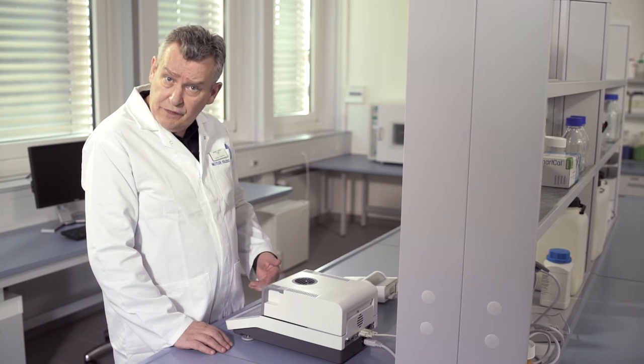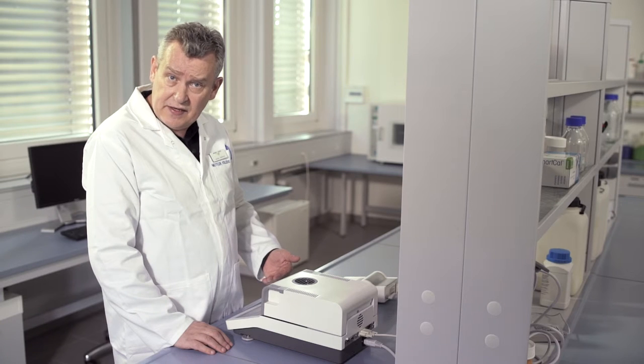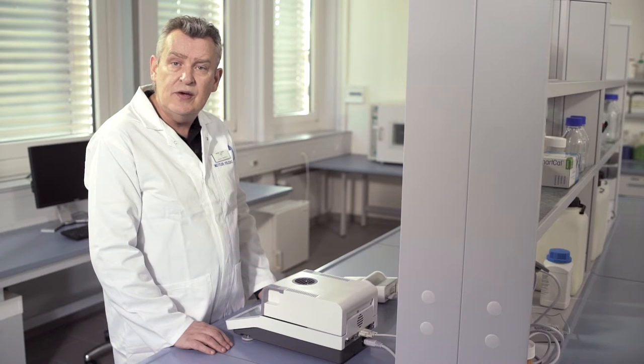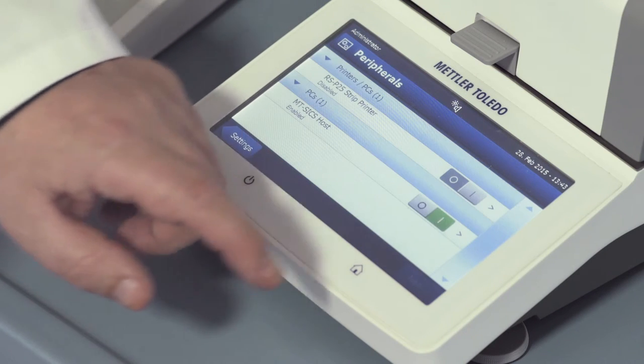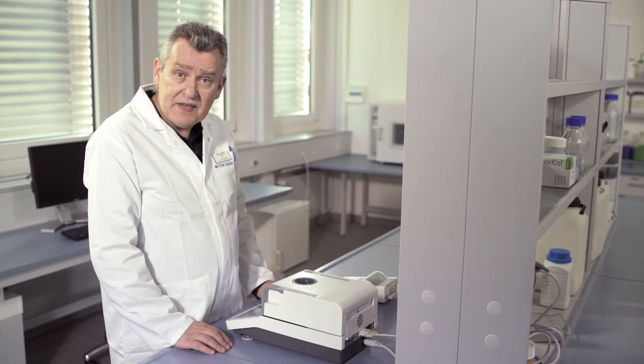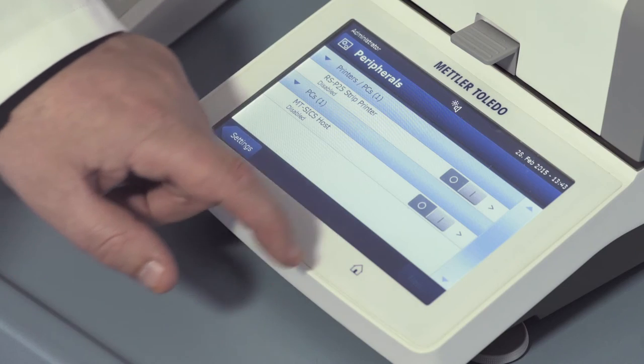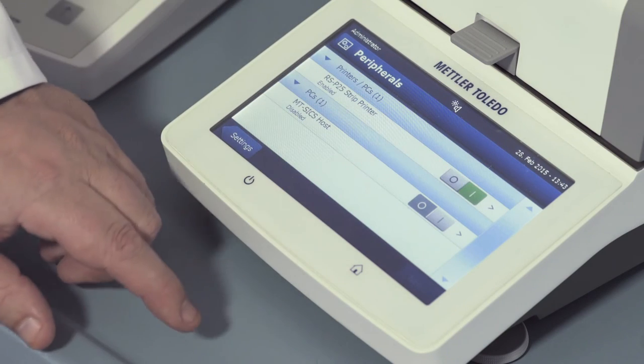However, you can also define customized interface settings in the menu of the HC103. Confirm the default settings simply by pressing save. And now, finally, activate the printer.